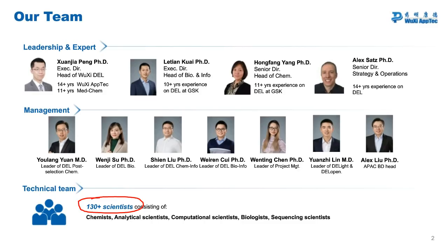Oh, kinase-specific. Okay. Well, one of the nice things about DEL is that it doesn't contain specific moieties that tend to hit kinases. And what makes that a good thing is that the hits that we find tend to be very selective for the kinase that they're screened against. The short answer is you could always make a DEL full of motifs that you already know bind to those kinds of targets. But if you were to do that, I think your chances of finding things that were novel and selective would actually be very low. And that tends to be the goal for kinases. The problem in that field isn't to find things that are active. It's to find things that are novel and that are selective.